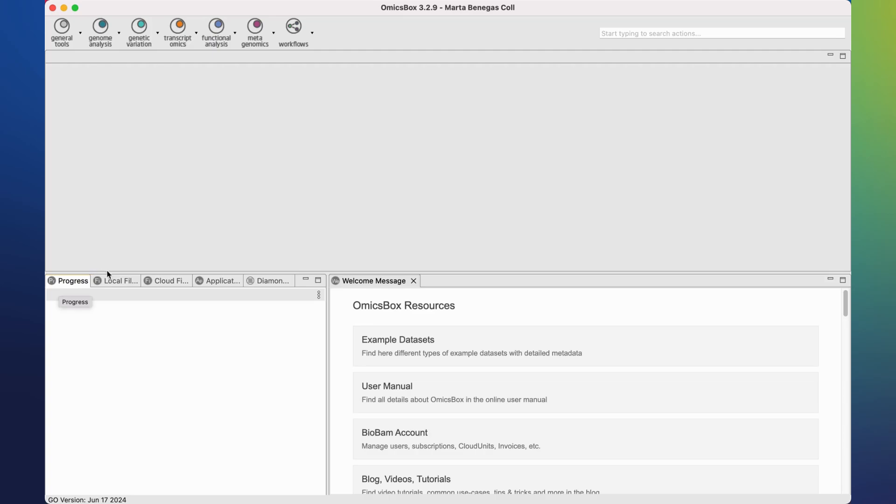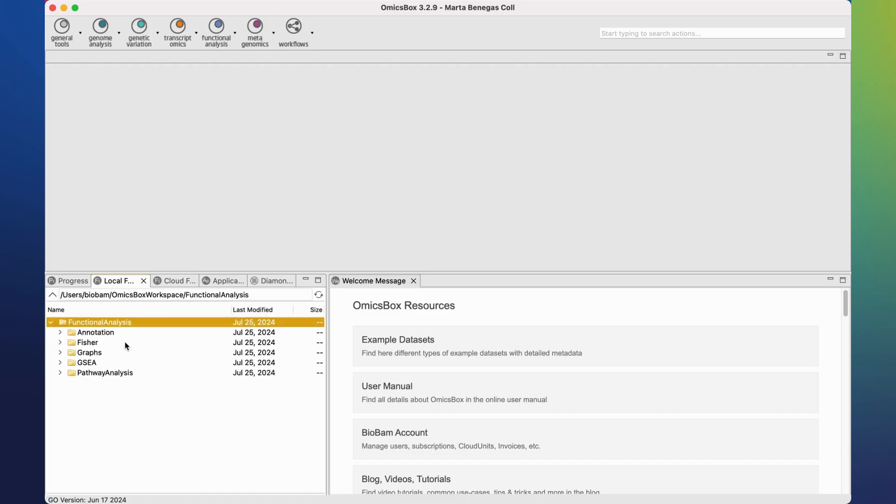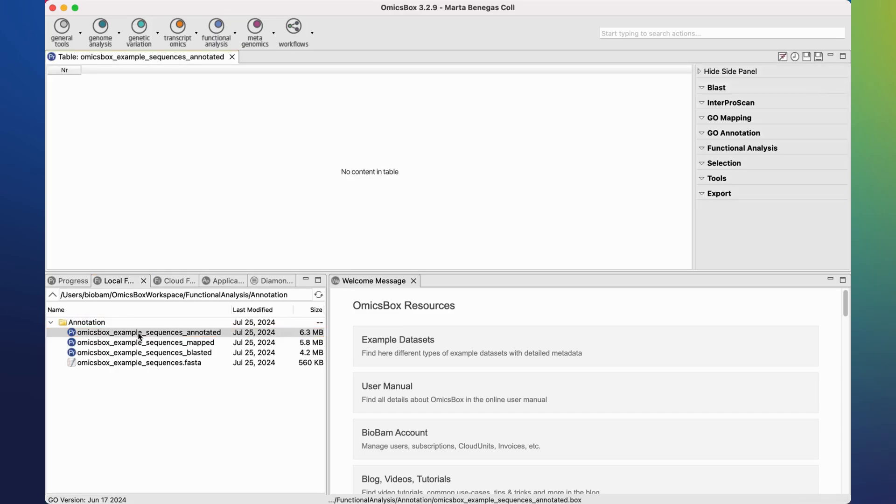It is possible to open OmicsBox files directly from the local files tab. Go through your directories and double-click on a file to open it.